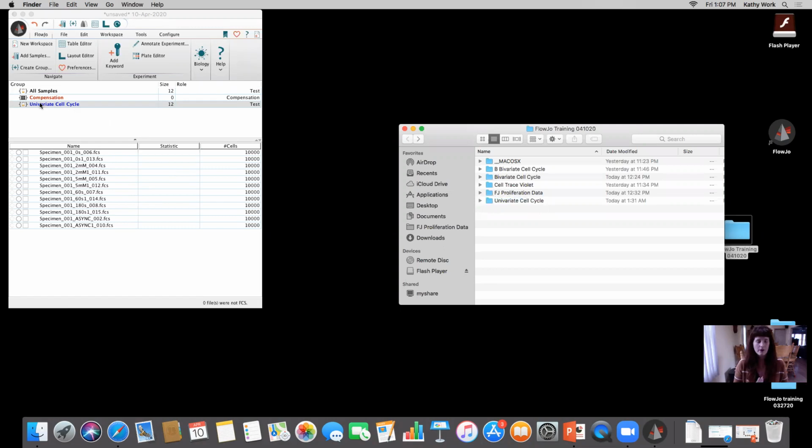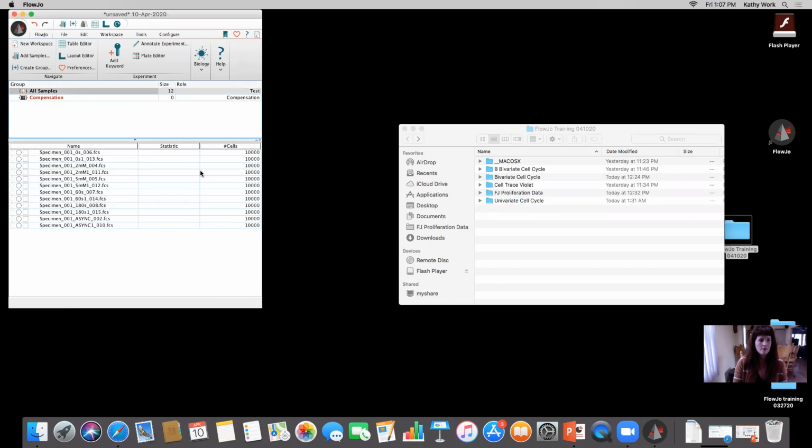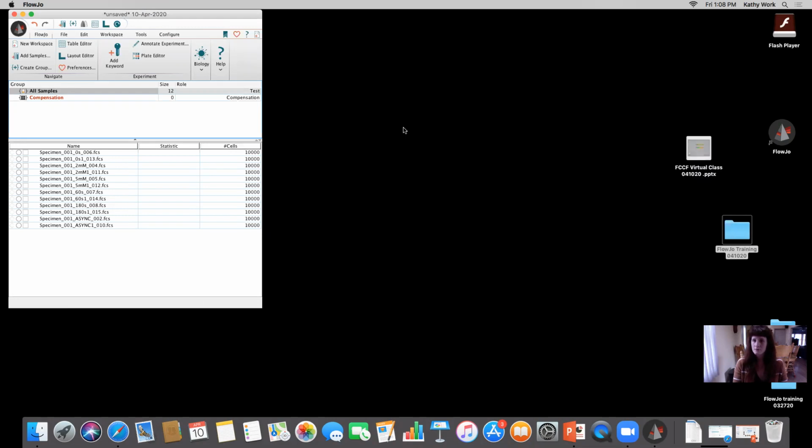It's up to you. We've had multiple discussions about this, so I won't dive too deep into it. I'm just going to delete that because I don't necessarily need a separate group, and I like to keep things a little cleaner. So I hit the delete key on my keyboard to do that, and then I'm going to X out of this file window.